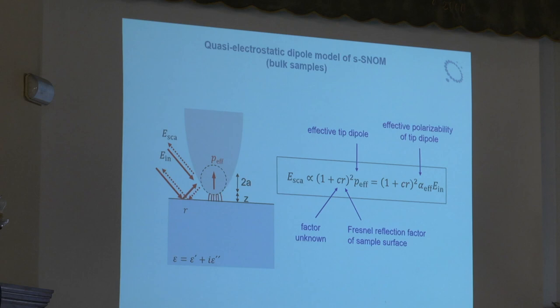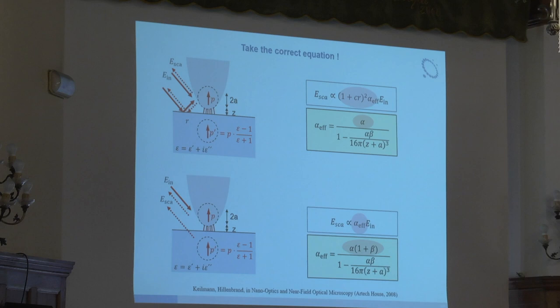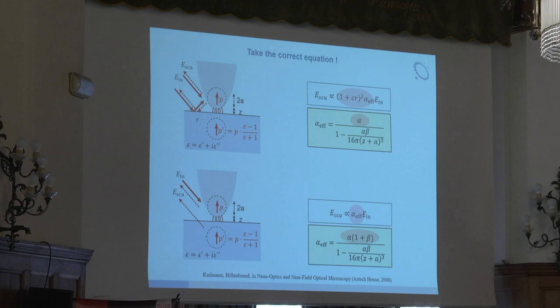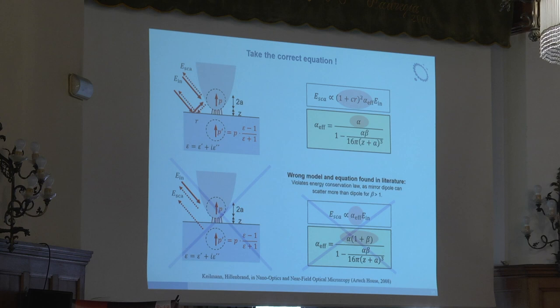This is not the true picture, and I will show later on, once you're into the topic, there's a second model that I see more and more showing up in the literature. That was actually the original model that was introduced. It was slightly different, and many people are still using it, and the thing is, you shouldn't use that. For example, that one is really wrong because it violates the energy conservation law. I will come back to this later on.